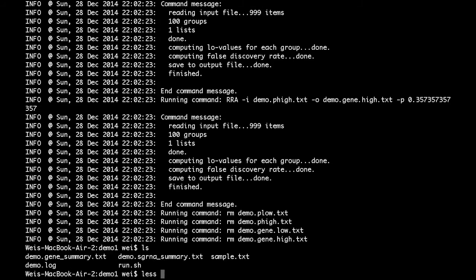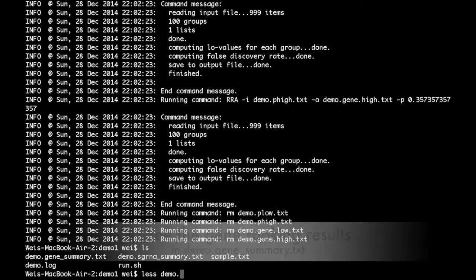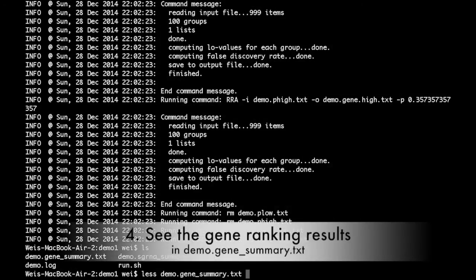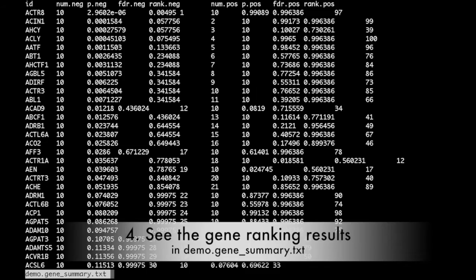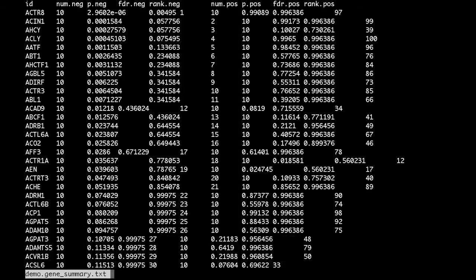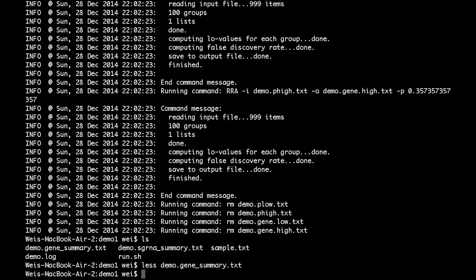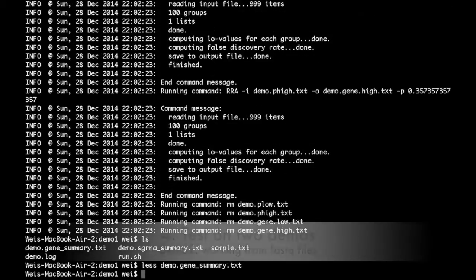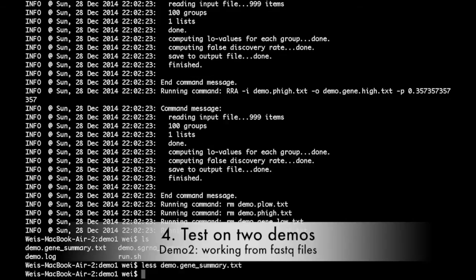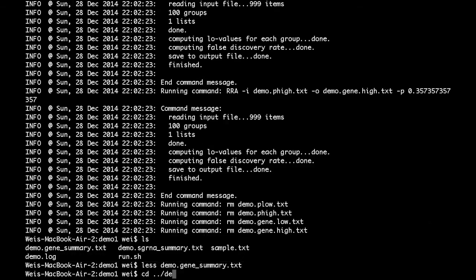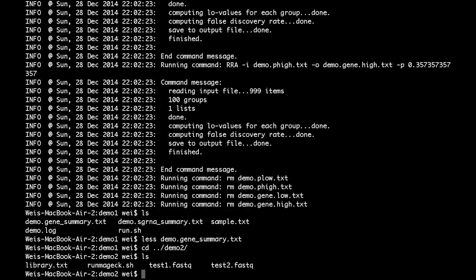Let's take a look at the gene ranking results in demo.genesummary.txt. This shows that the first demo ran successfully. Similarly, in the second demo, run the script that ends with .sh and check the gene summary file.